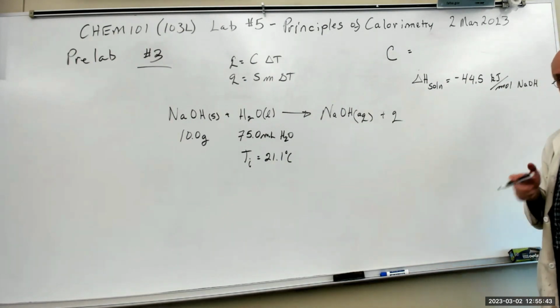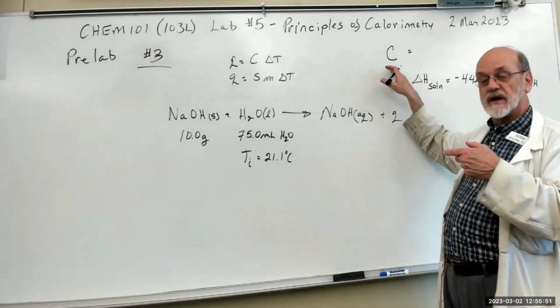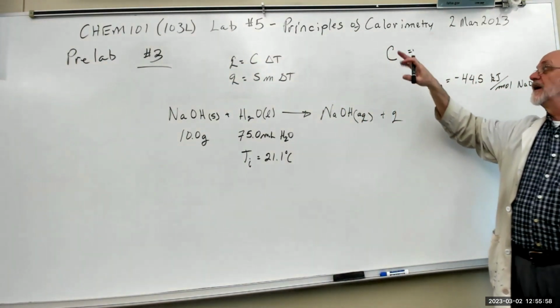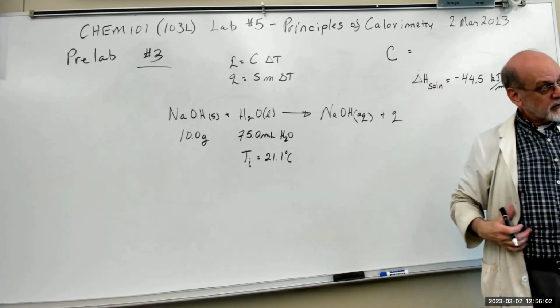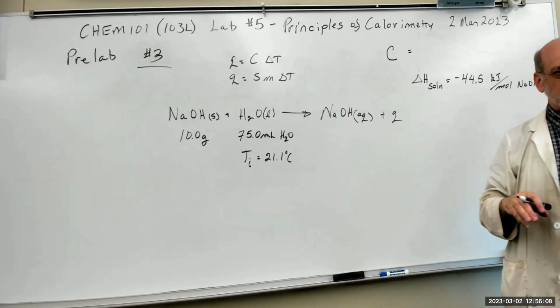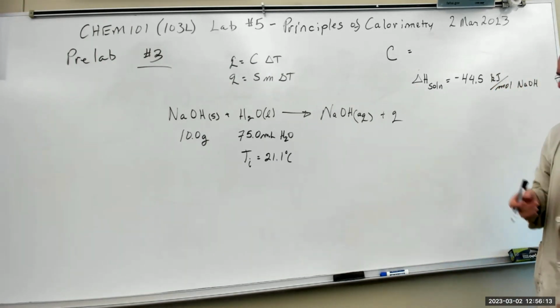Then when you reconstruct that calorimeter to do the experiments, you have to use all the same parts you did when you made it, because the variables are built in. If you change anything in your calorimeter, it'll give you a different C. So once you determine the calorimeter constant, don't change anything. Don't use a different thermometer, different cups, or a different lid. All the same stuff.